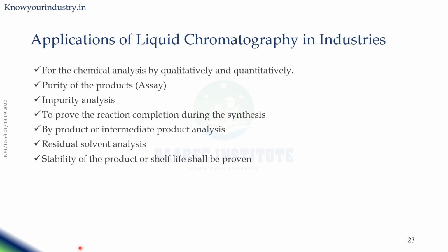Then you can check the purity of the products, like assay, etc. And then you can do the impurity analysis. Then you can prove the reaction completion during the synthesis. Then you can do the byproduct or intermediate product analysis. You can do the residue and solvent analysis. Then you can assess the stability of the product, or the shelf life of the product can be established using these liquid chromatography methods.